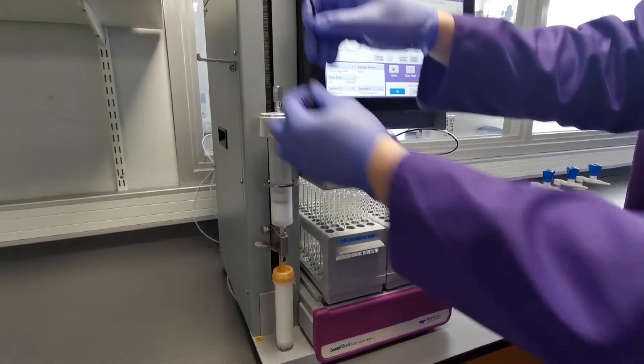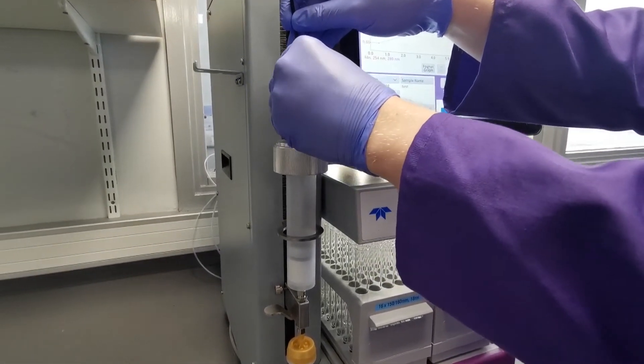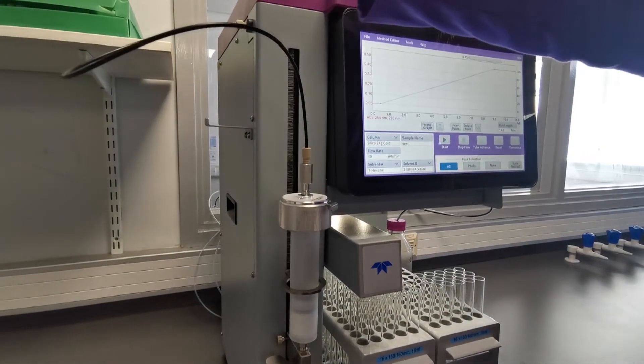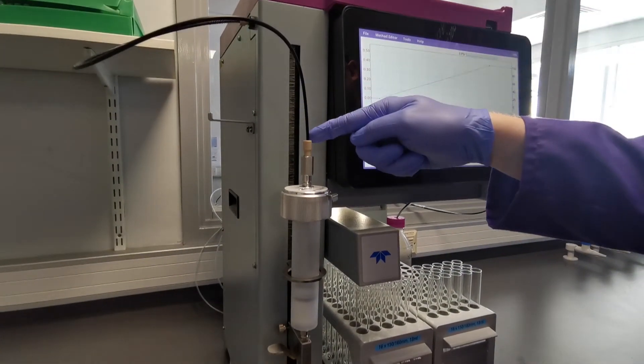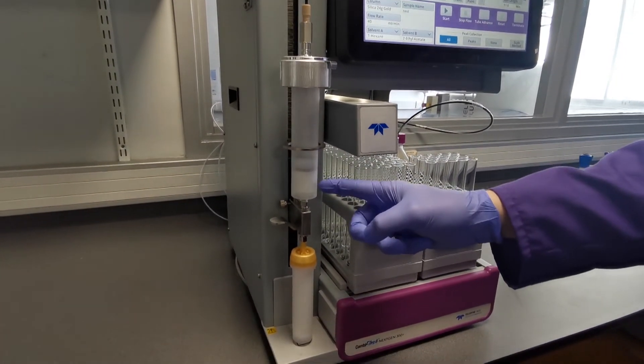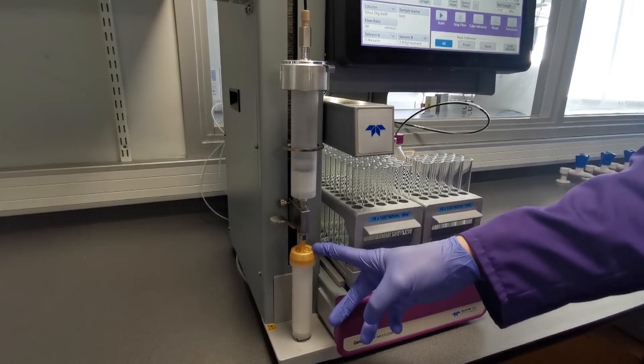We then use the tubing to connect to the top so that after the equilibration is done, the system will divert the flow through the bulkhead, round this tubing, through your dry loading cartridge, and load your sample that you've prepared directly onto the top of the column for the purification.